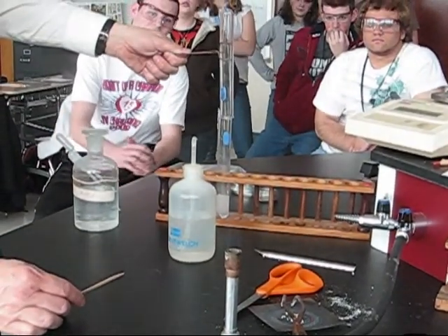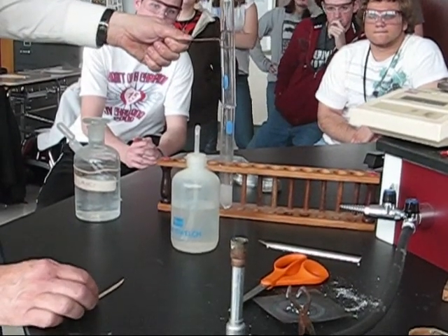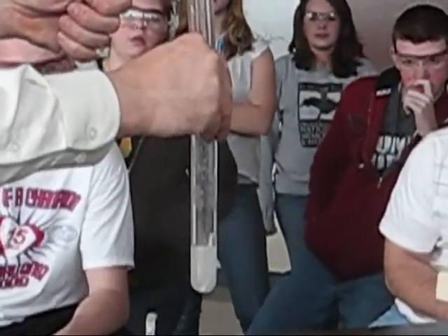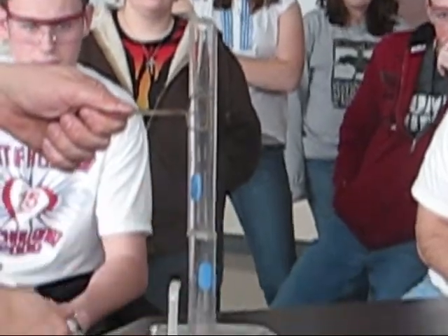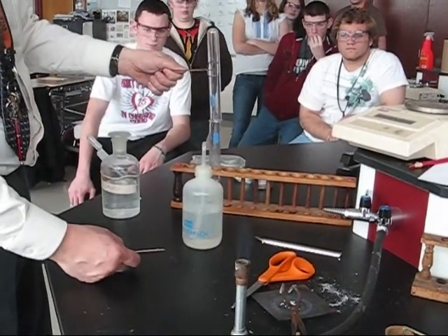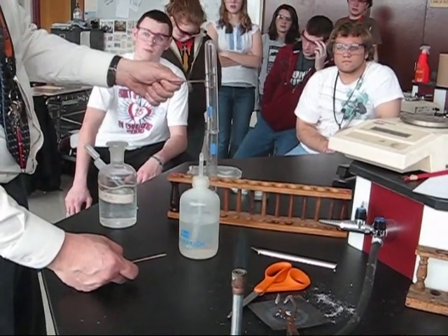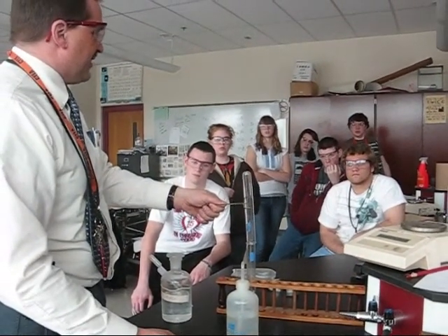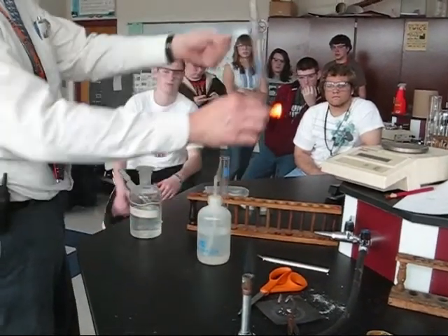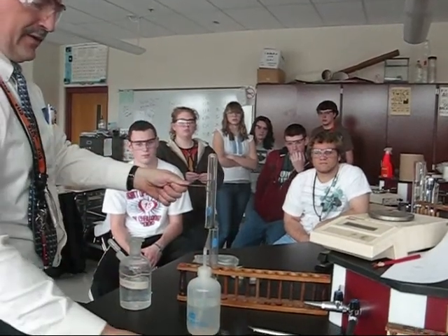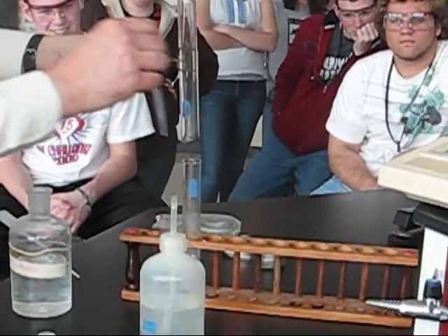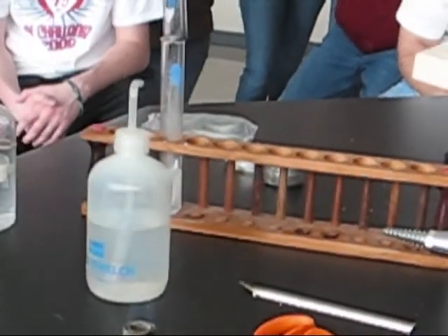Have you gathered enough hydrogen yet? It's kind of hard to tell because you can't see it — it's invisible. It's very light. That's why I'm holding the inverted tube, because the hydrogen goes straight to the ceiling. You've got to catch it when it's way up. It's about 15 times lighter than air, so you can imagine how much it would pop right to the top. Let's give it a go.